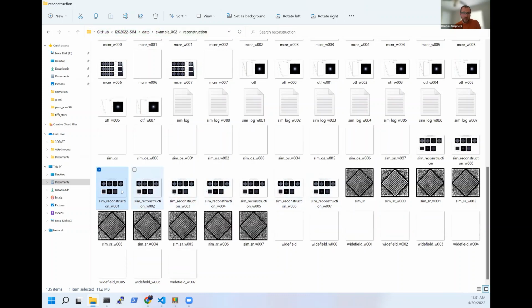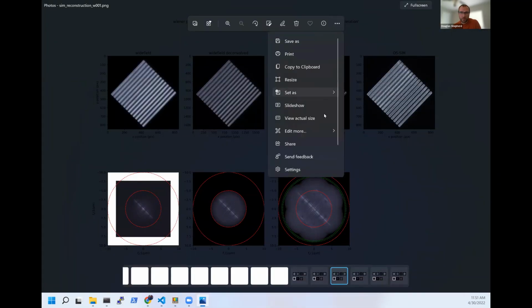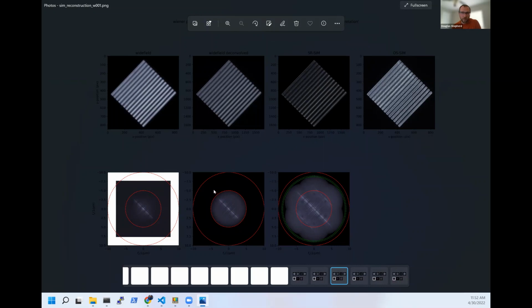And so let me just grab this one and bring it over. It's got transparency on, so I'm worried it's going to be difficult to see. Fortunately, I think we'll just have to look at it this way.